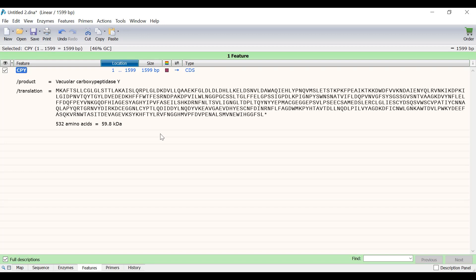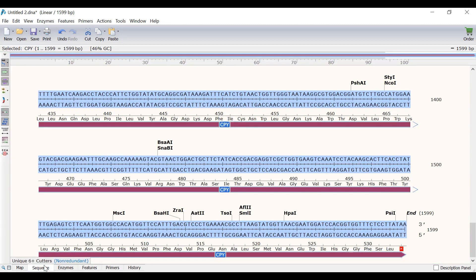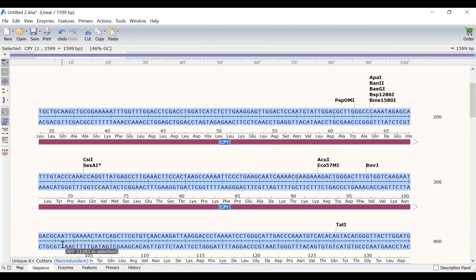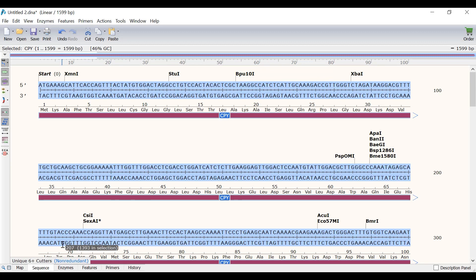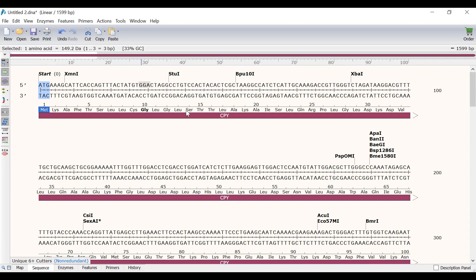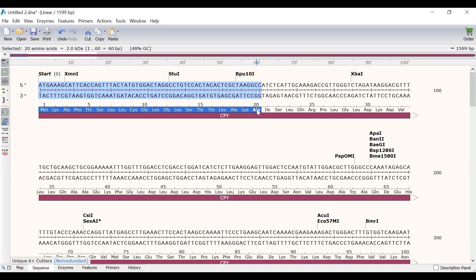Next, I will show you how you can split a feature into different segments. To do this, I will go to the sequence view. Specifically, I want to highlight the signal peptide of the CPY gene. The signal peptide covers the first 20 amino acids of the product. So, I will click on the first amino acid and shift click on the 20th amino acid.